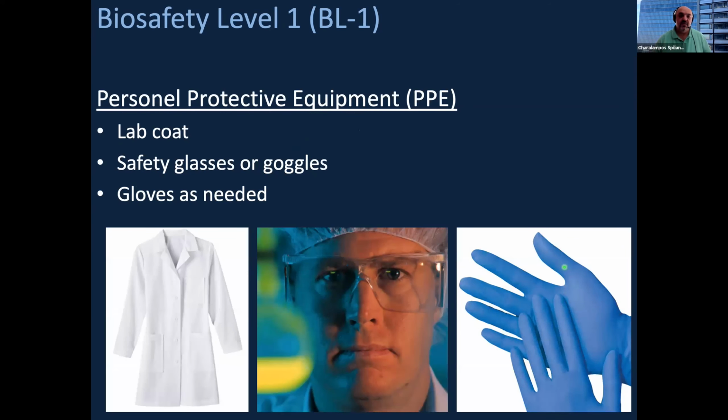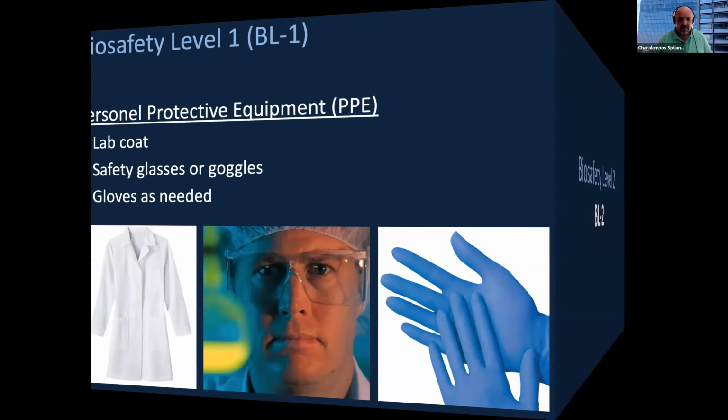Now, regarding the personal protective equipment, as was mentioned earlier by Anastasia and Petrus, we do need to wear lab coats to protect ourselves from being contaminated by biohazardous materials, safety glasses, and gloves. Depending on the work we do, we should wear certain kinds of glasses, as Petrus elaborated earlier.